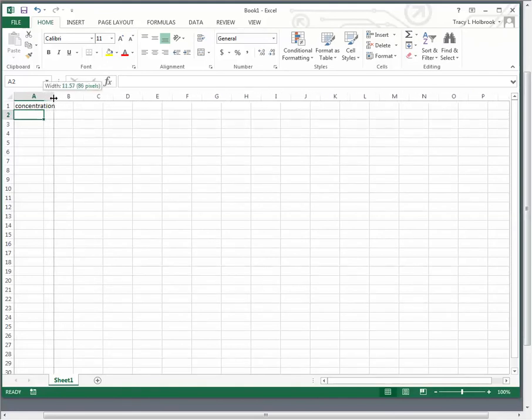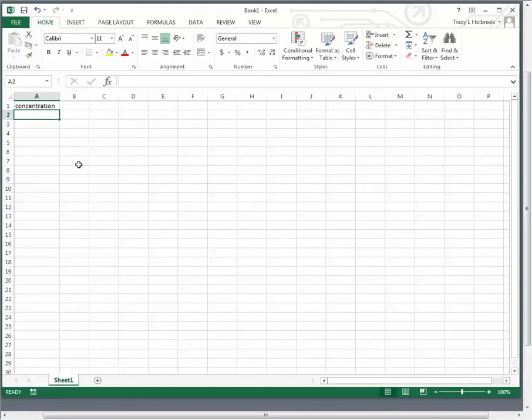And if I want to click and drag it to include the whole thing, I can. And I want to put ppm here in the next row, just so that someone can interpret this and know what you've done. So units are always important, right? And then in the second row, I'm going to put area, because that's the number from the tables on that report that I needed.